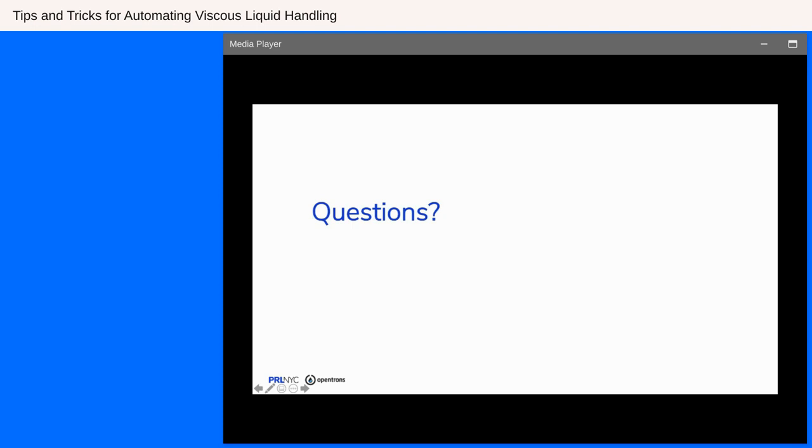Great, thank you. It looks like we have one final question. Are the aspirate and dispense settings in your presentation standard for each type of viscous liquid?